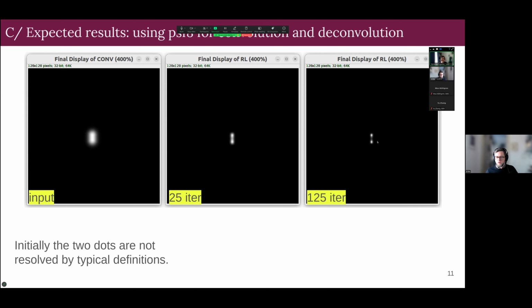Now you can think of what happens if you actually have an elongated structure from the beginning. Would you get a thin elongated structure, or would you get spots? There's a slight ambiguity when it comes to the resolution limit, which is, I'd say, not trivial to understand or explain. I can't do it, I guess.